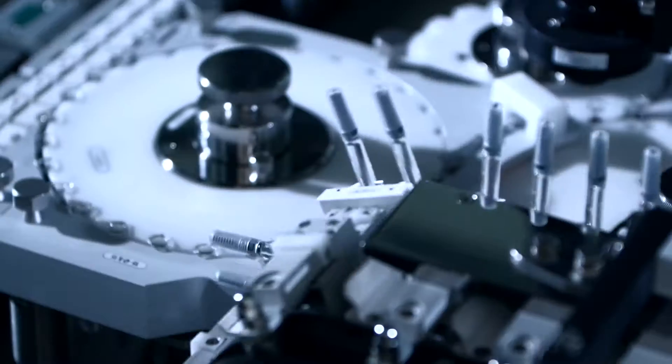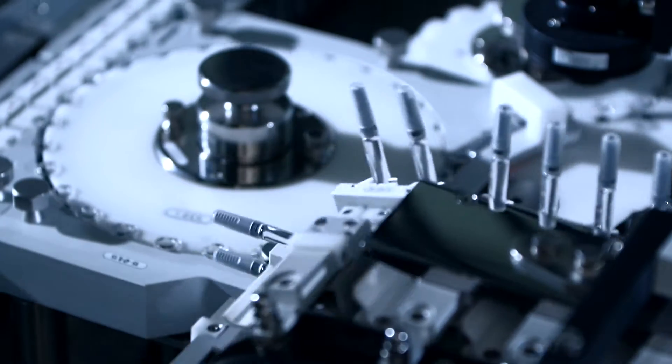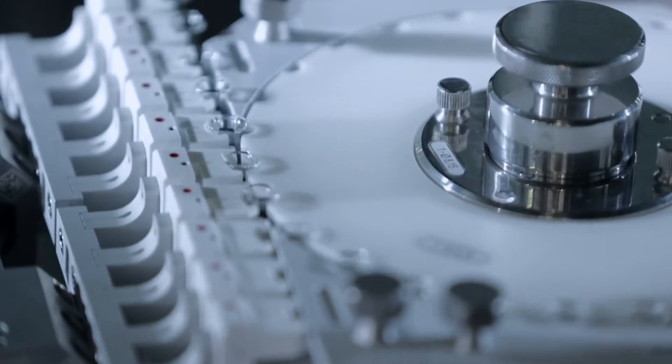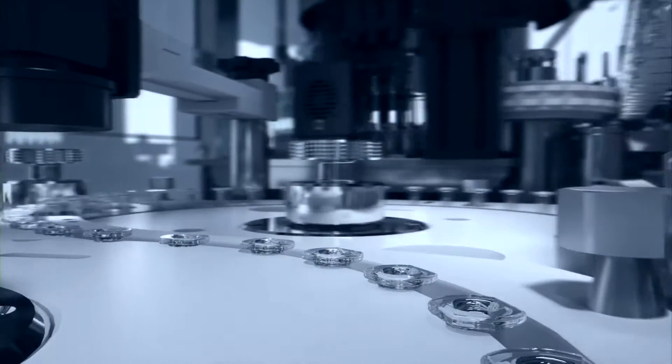Syringes are always picked one by one. To avoid any possible contact between them, the gentle handling strategically prevents the generation of bubbles.